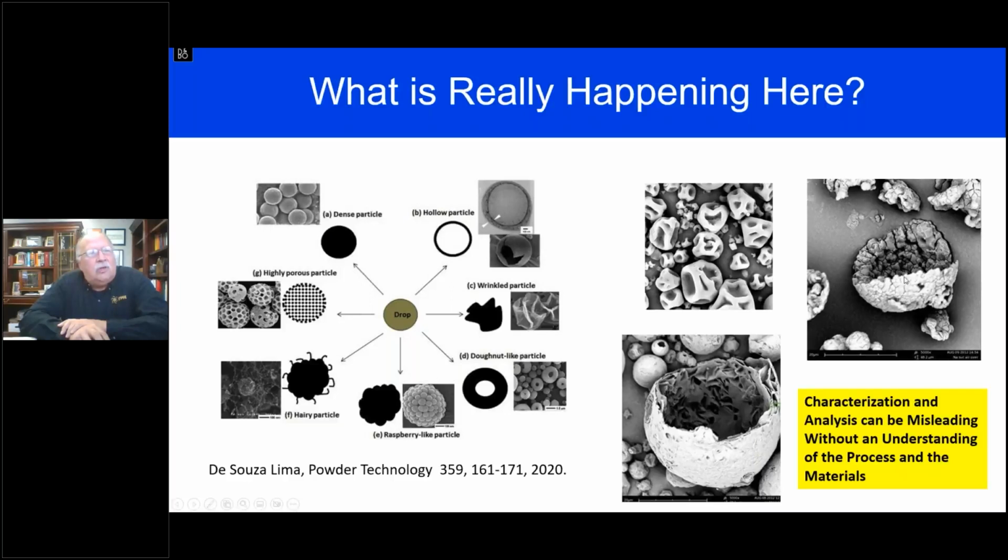And now if you look up at the kitty corner picture at the top, you've exposed this very nicely crystalline particle, and it's absorbed water, and it's really changed the structure. In fact, the big particle in the middle is a broken particle that's kind of mushed out a little bit, which is interesting. But what's really interesting is the particle up in the corner here, where these particles actually agglomerated. They got wet enough in the process chamber or after the process chamber to change shape.